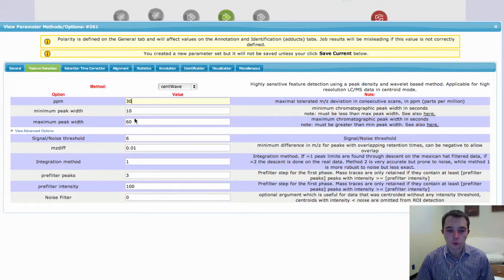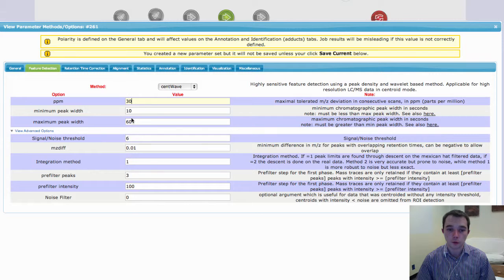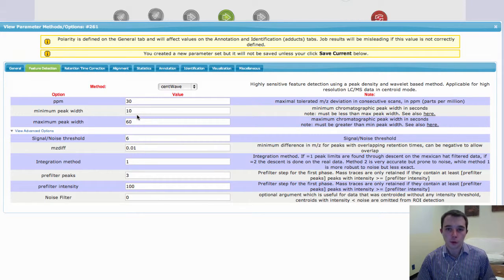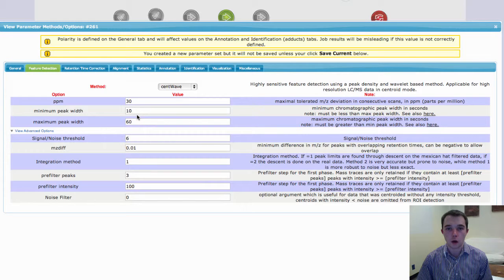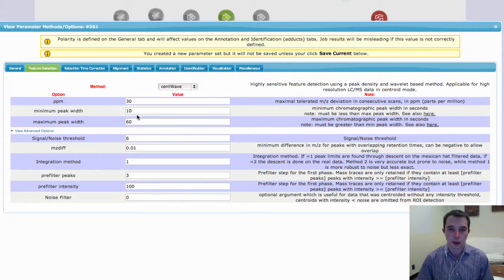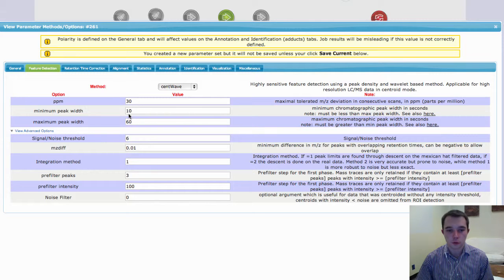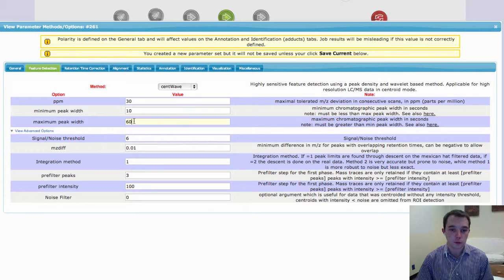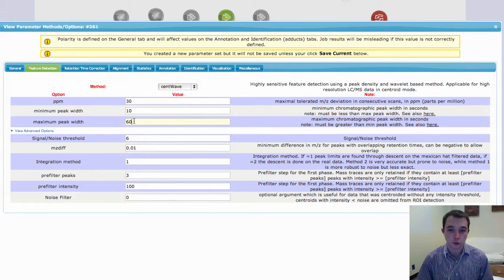The other thing that you want to be thinking about is how wide your peaks are in CentWave. And CentWave has a minimum and a maximum to this, and they're not hard and fast limits. It will stray out a little bit, but it helps the algorithm to understand what your data looks like. And so here this would be equivalent of 10 seconds on the smaller side and 60 seconds on the larger side.